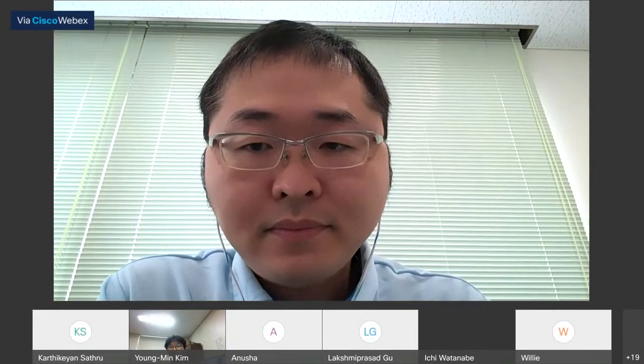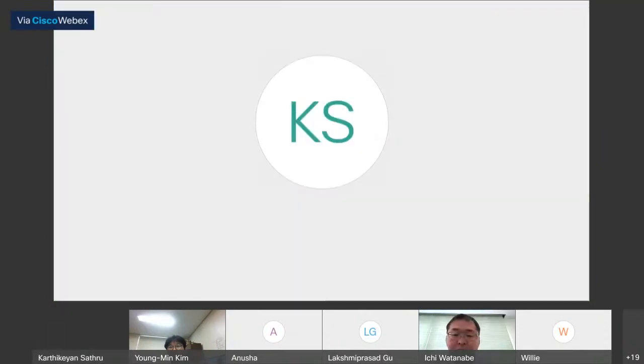Okay, thank you. So the next question coming from Subban Kumar: is the tandem reactor applicable for analysis of microplastic? Kim-san actually answered, you can just explain a bit here. Because maybe, is it a conversion or analysis? So maybe you can clarify that part. Yeah, Kim-san.